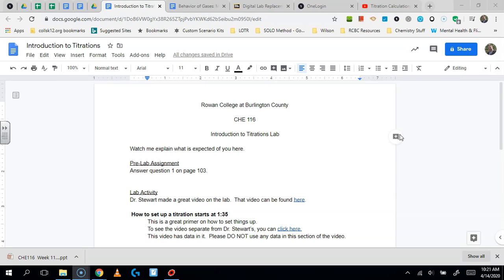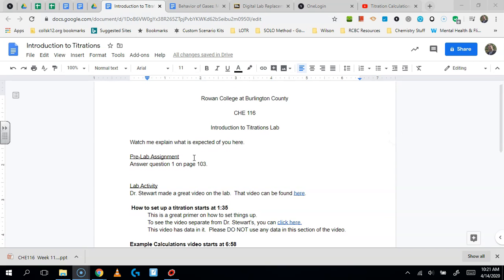Hey everybody, I just wanted to spend a little time talking about the Introduction to Titrations lab and what you're expected to do. In this lab, there's just a pre-lab, one little question on page 103, which is funny because that question is at the end of the lab. But I still want you to answer that because it's a vocabulary question. I think it's important to know the difference between an endpoint and equivalence point.